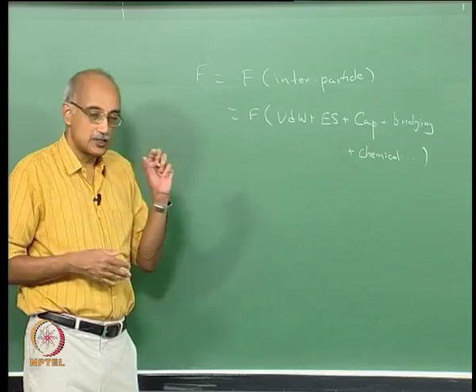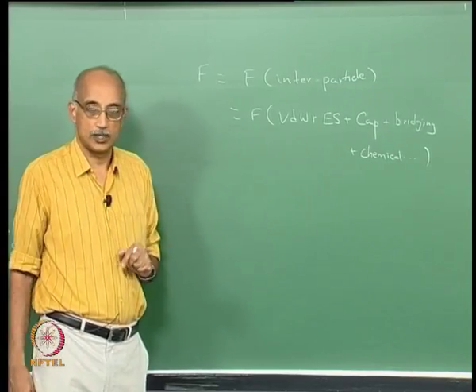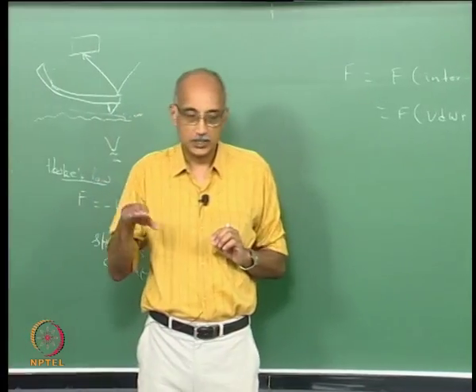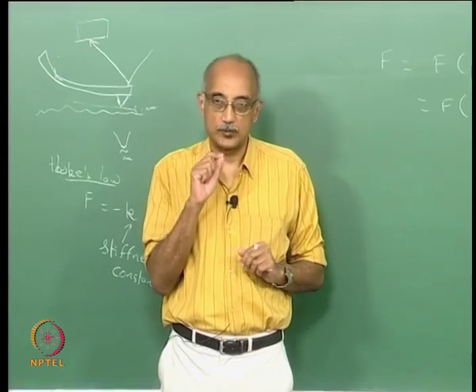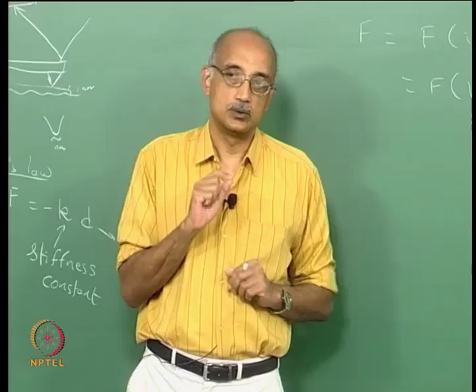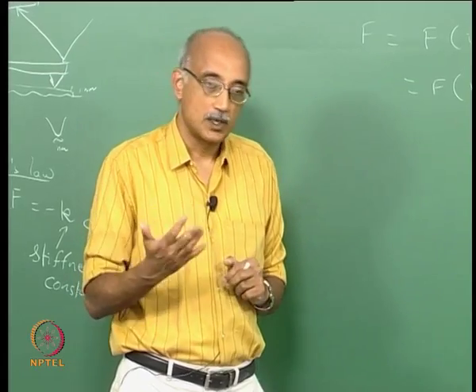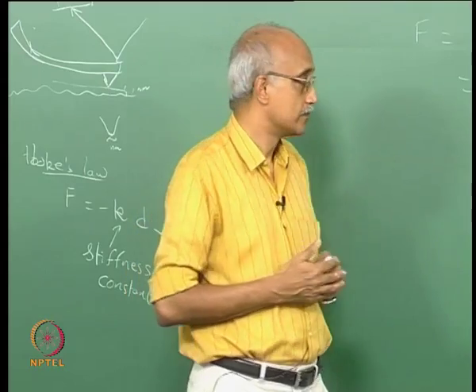And as the distance between the particle and the surface changes, each of these forces will change as well, and therefore again the atomic force microscope is a very sensitive detector of changes in surface morphology. It can even detect grain boundaries that are nano dimensional. There are very few other techniques that are really able to do grain detection under essentially environmental conditions rather than in high pressure, low pressure type of environments.